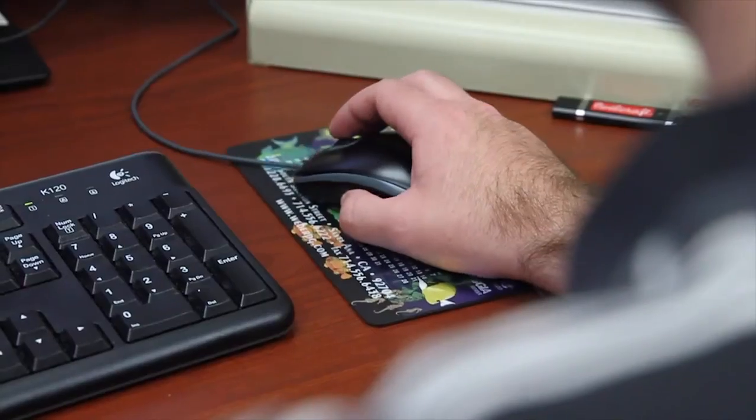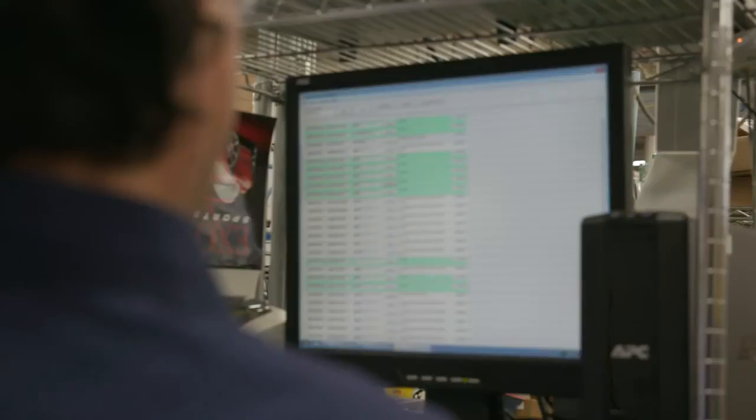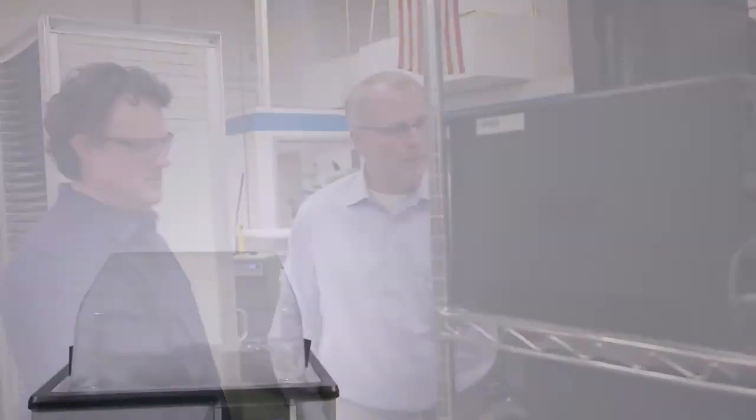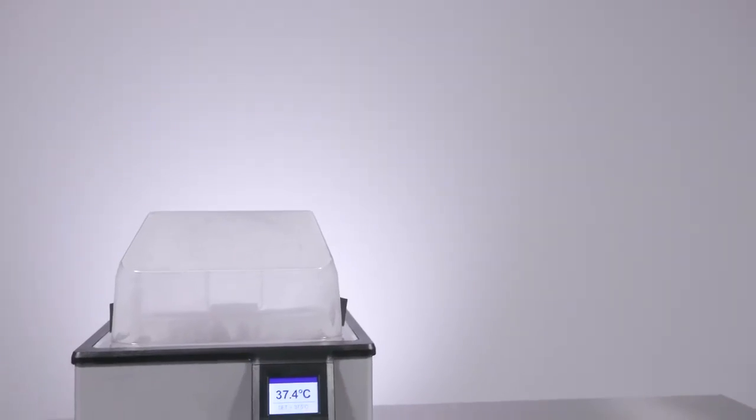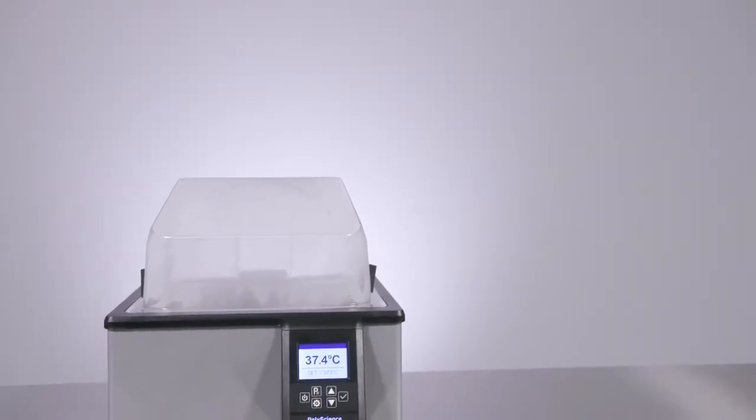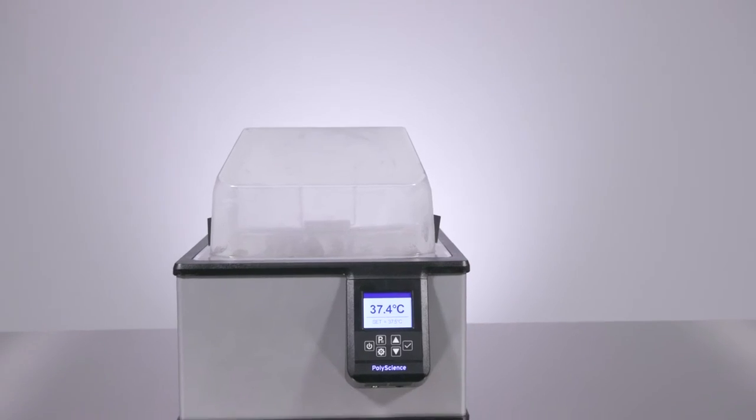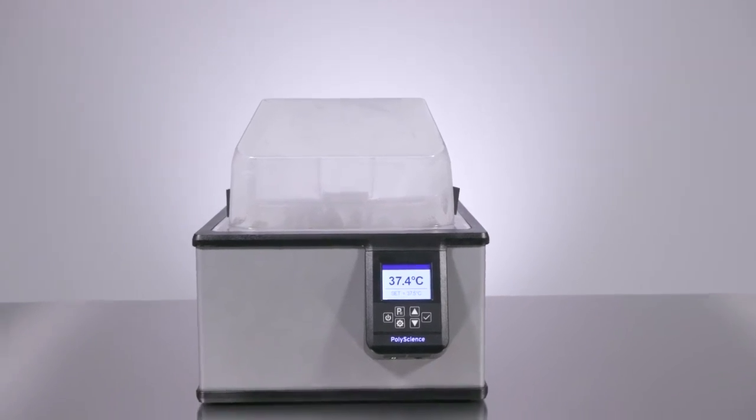Research, communication, and listening to our customers' needs are what drives the innovation to make the new PolyScience line of water baths stand out from the competition.